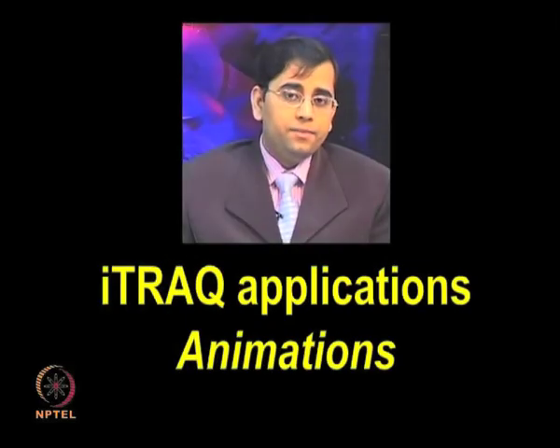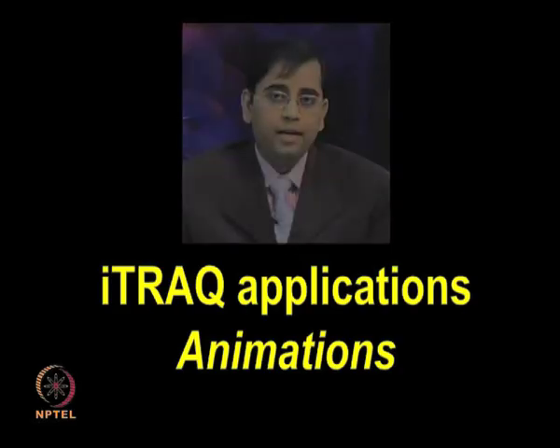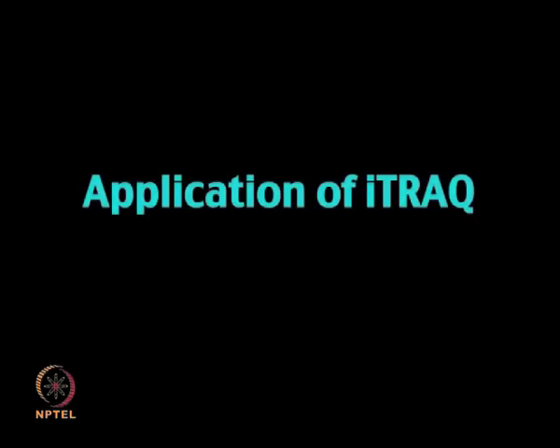Let us briefly look at the iTRAQ applications, and I will show you this in this animation. In this animation, we will look at one application of the iTRAQ method. A study performed by Boylan et al. in 2010 used the iTRAQ method for identification of candidate biomarkers in ovarian cancer serum.